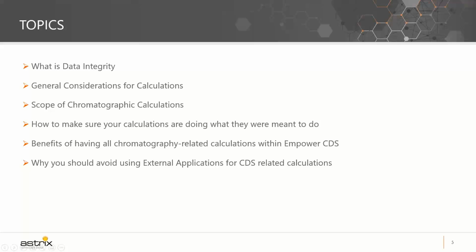So this means that the CDS, in our case here today, Empower, will typically generate large amounts of data. Transcribing all that information to an external system can present huge risks from a data integrity perspective.